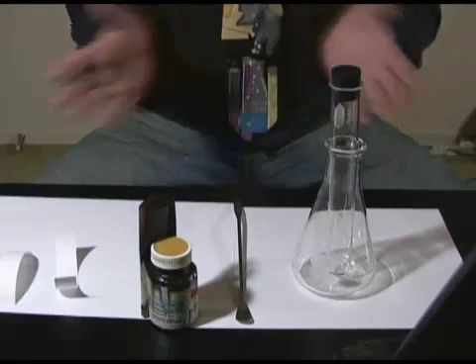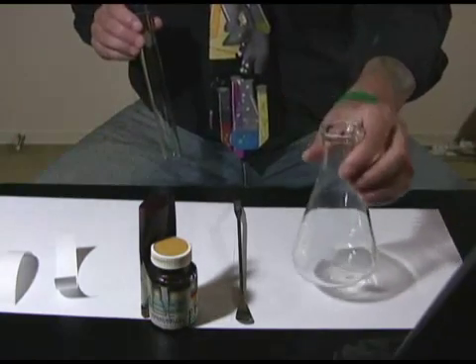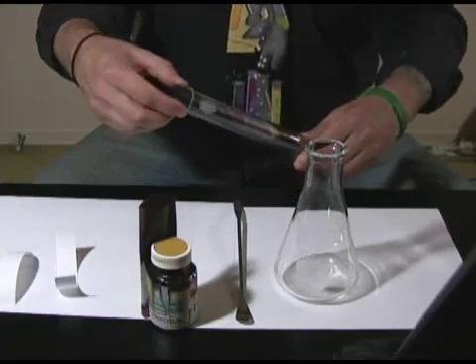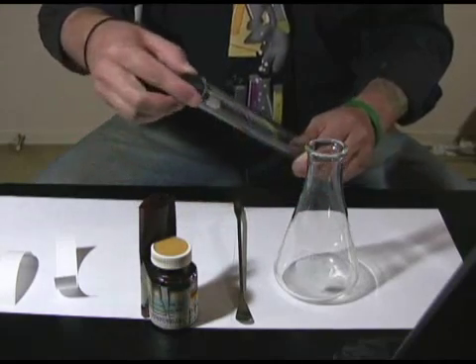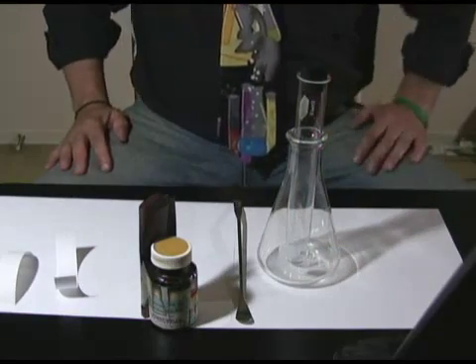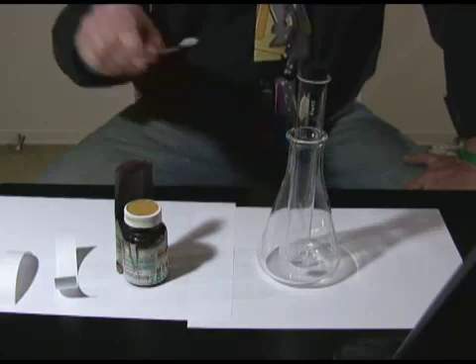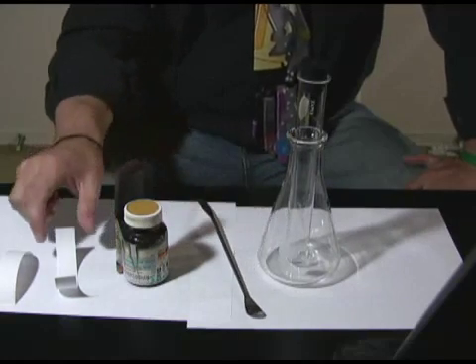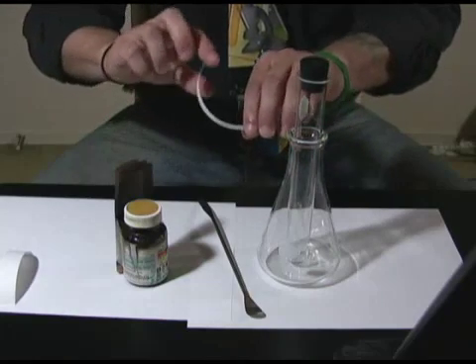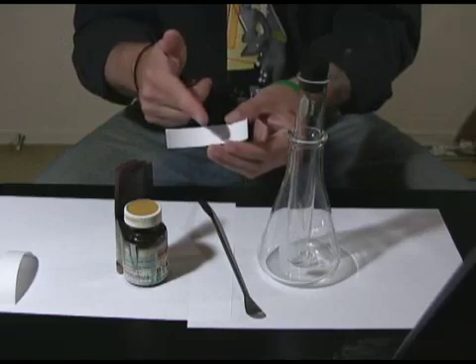Here's the equipment I need for this demonstration. This is an Erlenmeyer flask, which I'll use to support a large test tube, along with a rubber stopper. I've also got iodine crystals and a spatula to handle them. And I've got these pieces of chromatography paper — you could use filter paper — something porous that can pick up the fats in your fingerprint.